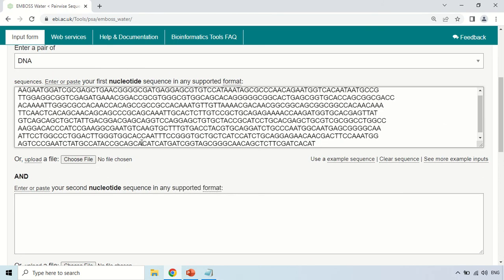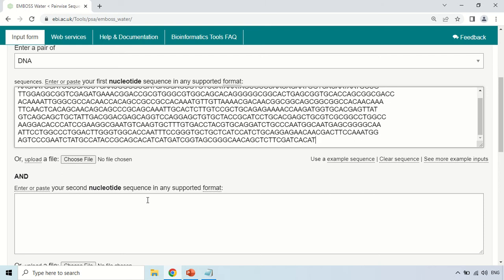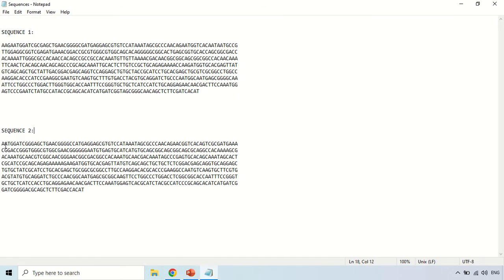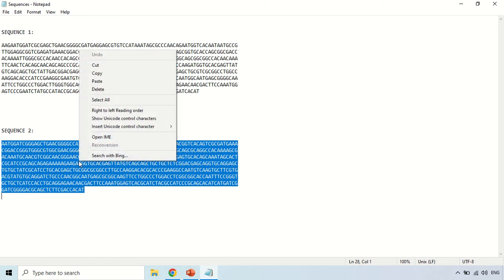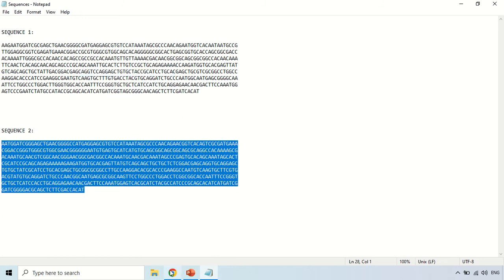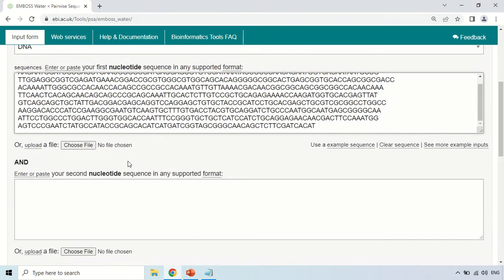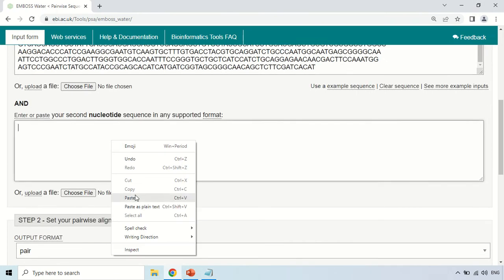You can also choose the file of the first sequence instead of copy-pasting. In the second box, we have to paste the second sequence, so I am moving back to the sequences and selecting the second sequence. Just copy it and paste it into the second box.